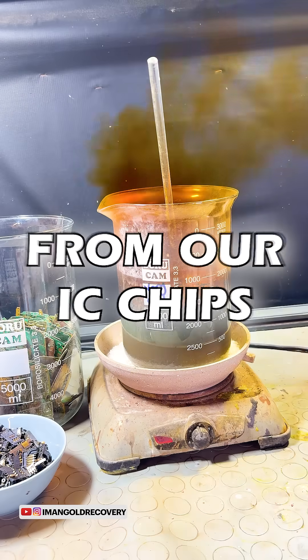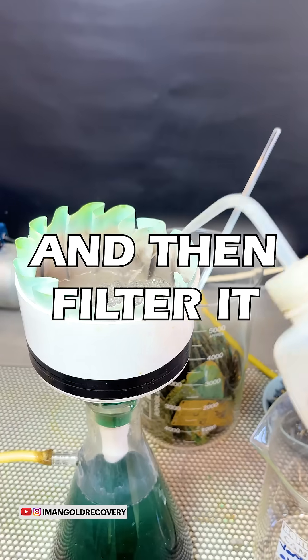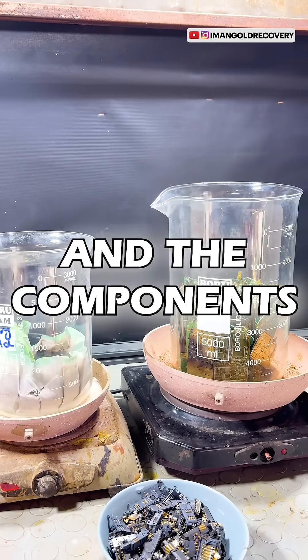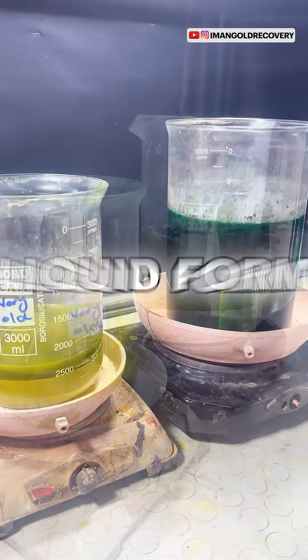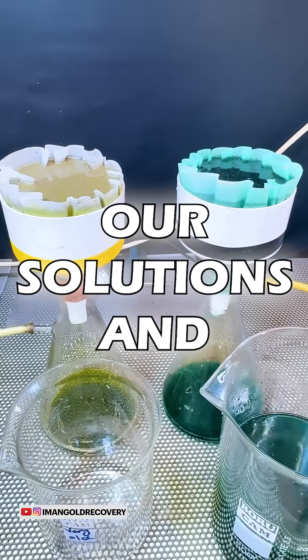We pre-treat the ash from our IC chips to release the gold contained in them, and then filter it. At this stage, we separately leach the ash from the ICs and the components containing visible gold so that the gold in them is converted into liquid form. After two hours, we filter both of our solutions and mix them together.